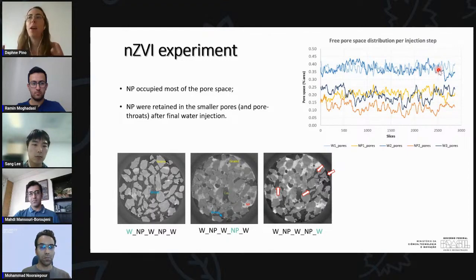Then we said, what happens if we inject nanoparticles again? What will it look like? Then we got this orange curve here, and we see we actually reduced our porosity even further. So what we think was happening here, either we were able to inject more nanoparticles, or what we believe was happening, especially because after we injected water again, we actually get this dark blue here. So we see we did not fully recover our porosity after the second nanoparticle injection.